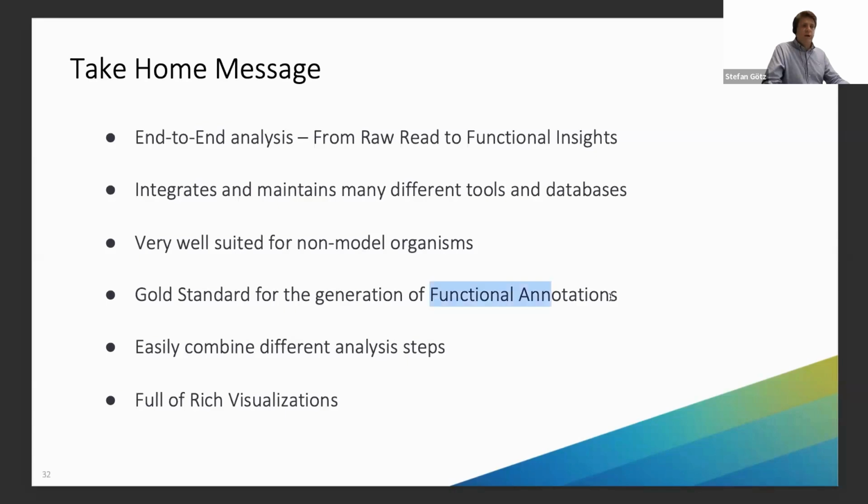So in terms of the functional annotation, I had not really a lot of time to show you all the different details on how to perform functional annotation. I hope I could show how you take different source databases like Interpro, KEGG, and Blast-based annotations and merge them into one big project and use the power of combining different sources of information. And this is the gold standard for functional annotation as well, by following the Blast2GO methodology.